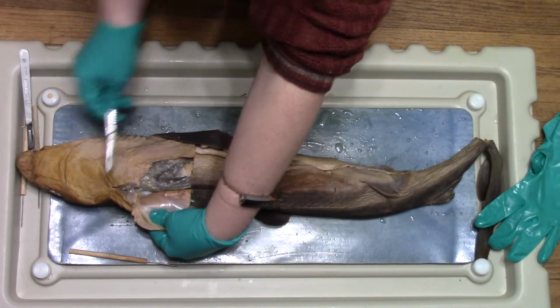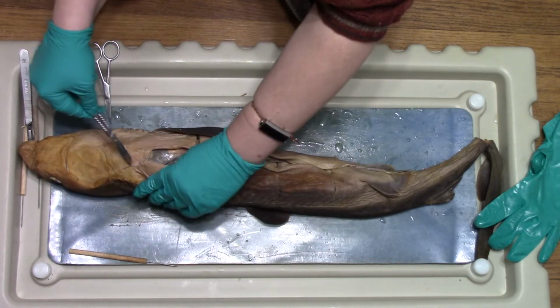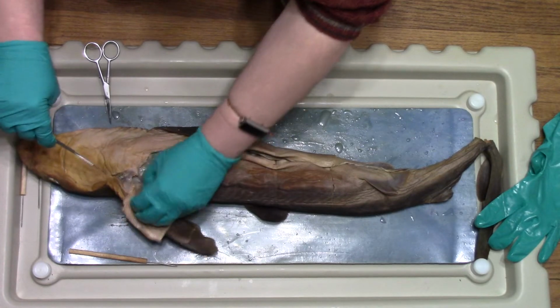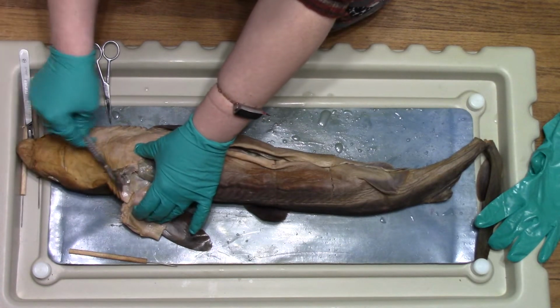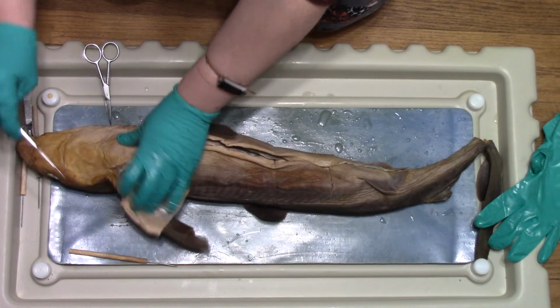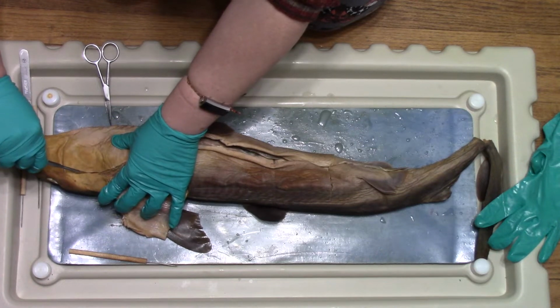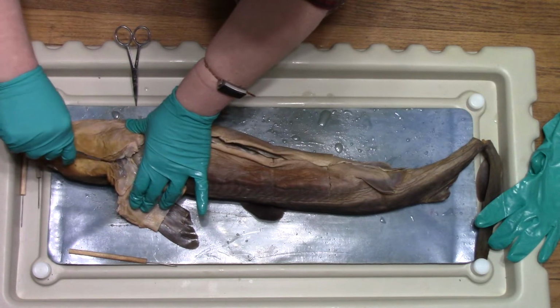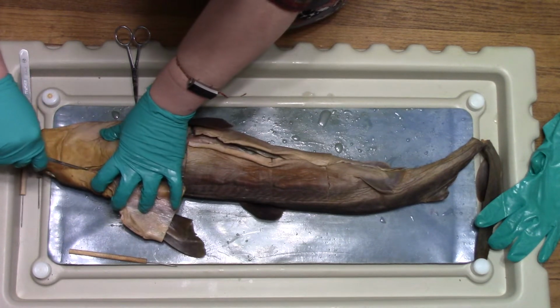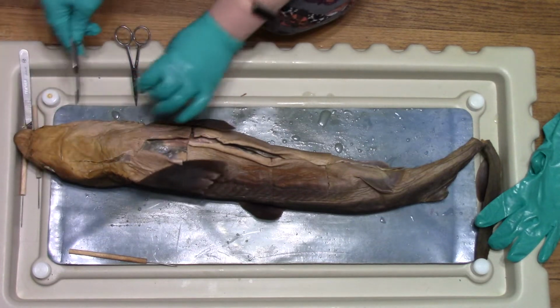There we go. So that's the bone, but it's cartilage that's connecting the pectoral fin. It's the hardest bit to cut through because it's quite a substantial bone there. To open this sucker up, you want to be able to open.